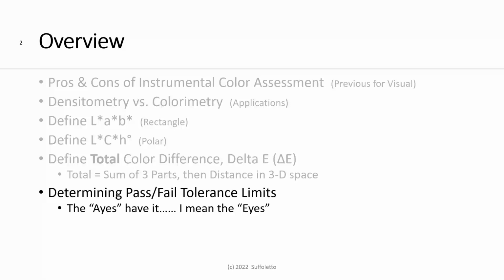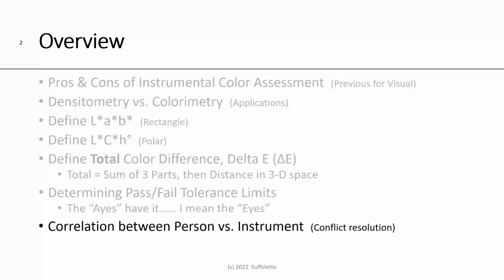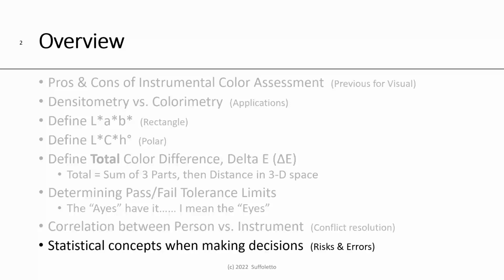We'll determine pass-fail tolerance limits. We'll correlate between person and instrument. And we'll talk briefly about statistical concepts when making a decision.